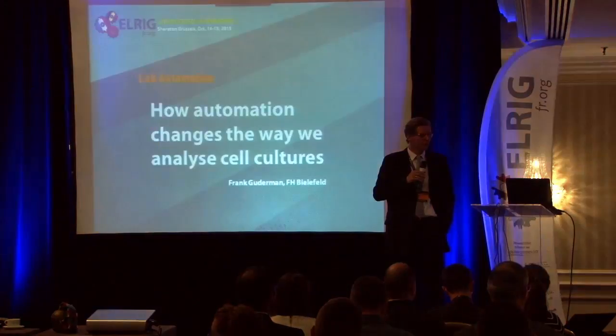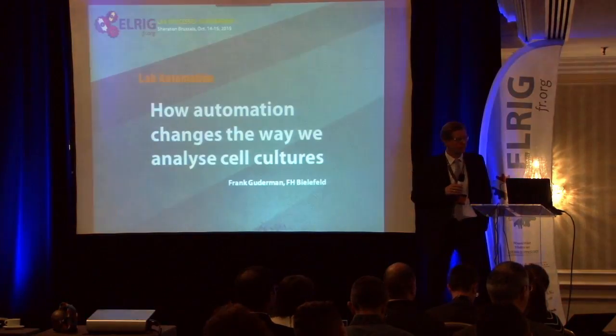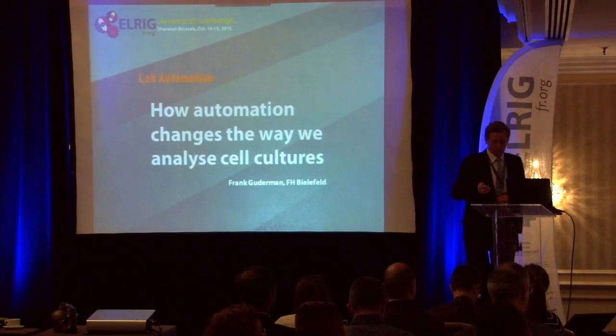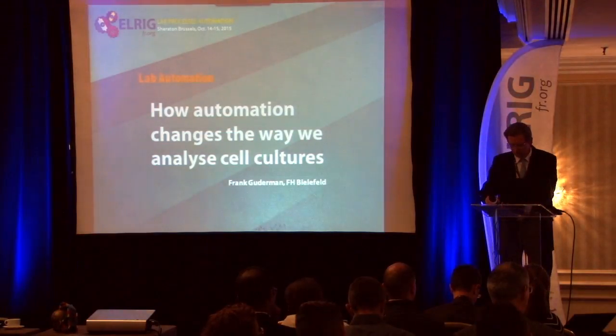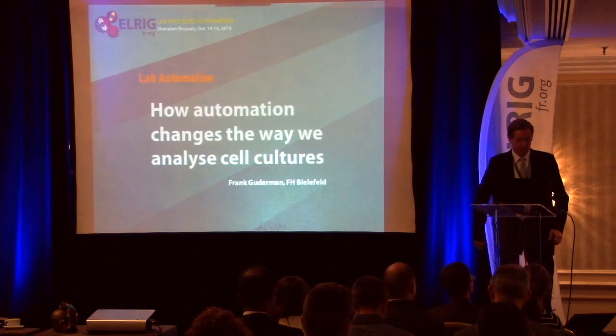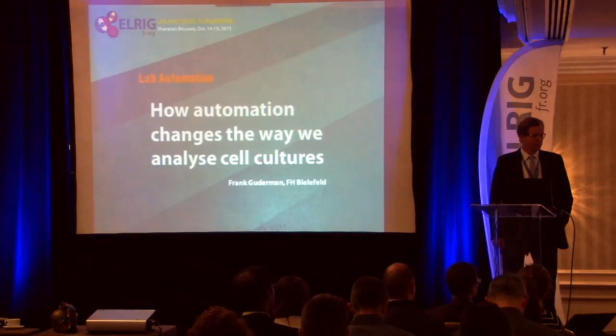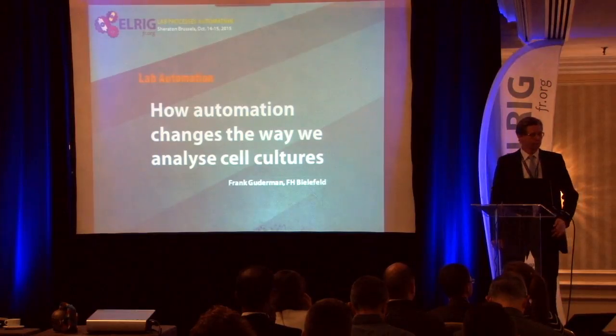Thank you very much. I think this is a subject that we can continue during the workshop or another meeting with ELRIG, because that's a totally different approach. So 4 years to program a robot, I think that now with the evolution of the technology it could be lower than that. But what is great in that concept is that you have the as-is situation, and then you put something in and you use all the instruments that you have already in your lab.